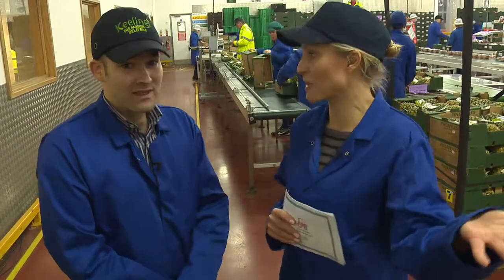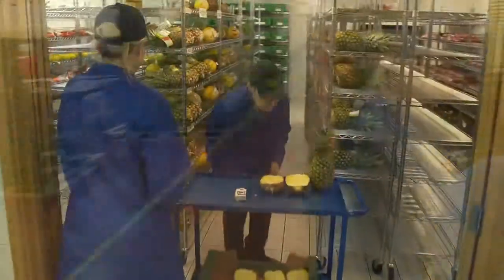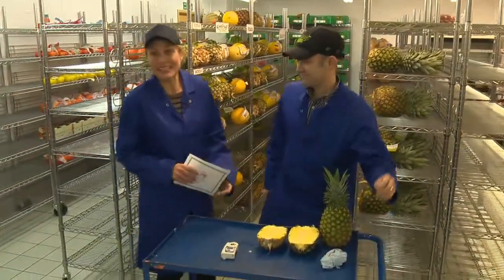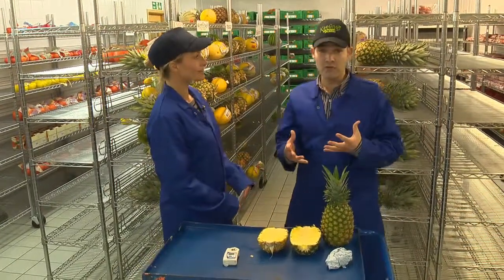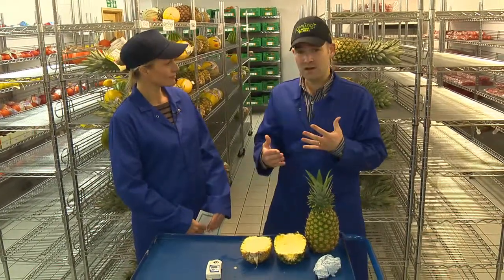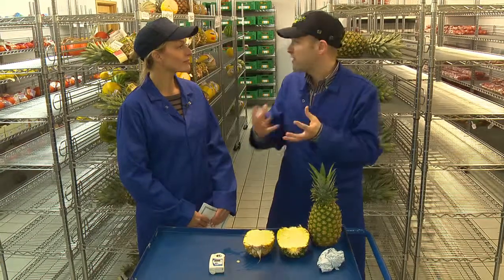I know that they still take space in a very special room. That's right, so can we take a look? Let's have a look. So this is our shelf life room. Every time we send some pineapples to the stores, we keep back a sample to monitor the shelf life and the freshness of the fruit to make sure that it's keeping okay.